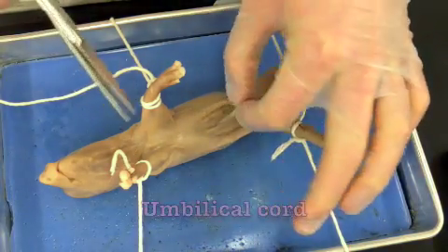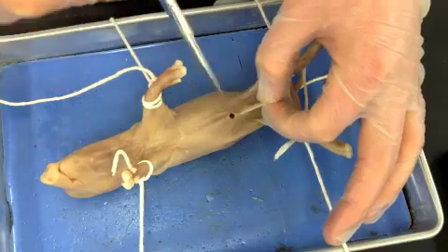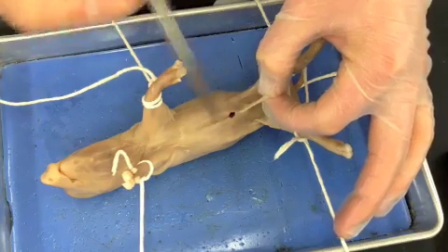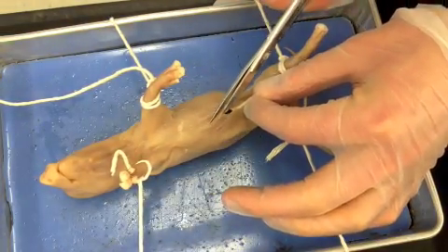I start by grabbing the umbilical cord as a handle and slowly snip until I see an opening. That opening lets me know that I'm in the abdominal cavity — the cavity is nothing more than a hollow space filled with organs. Then I start my cut moving up.